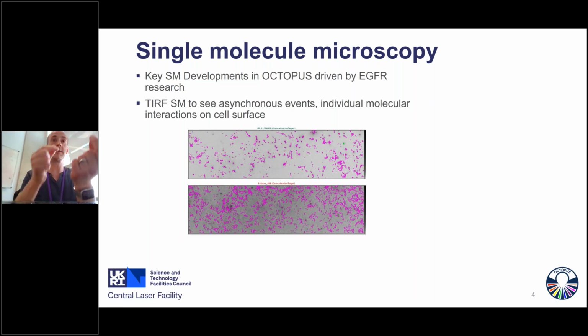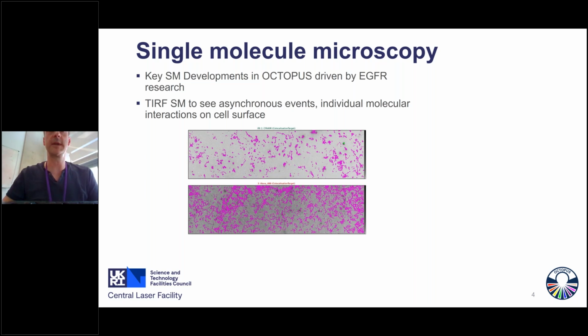You might, for example, be labeling different parts of the molecules in the two channels with two different fluorophores, but you see how you can get very rich asynchronous events to actually understand exactly the dynamics and the interactions between the things you're labeling, and that's why single molecule microscopy is something they were trying to apply to understand the epidermal growth factor receptor interactions.